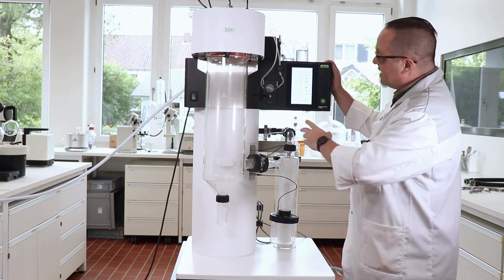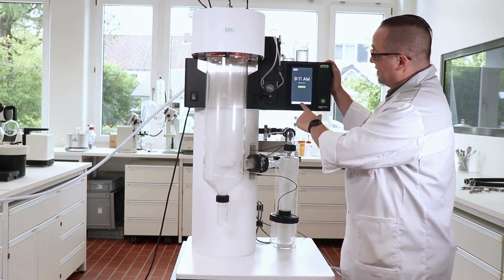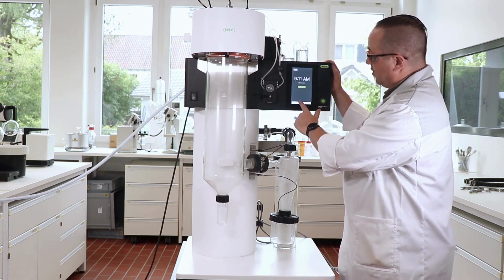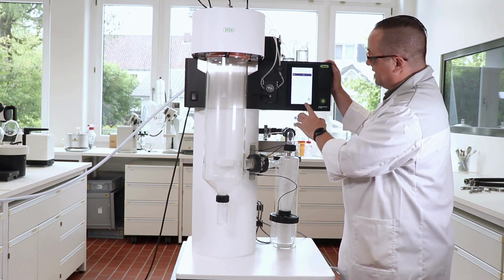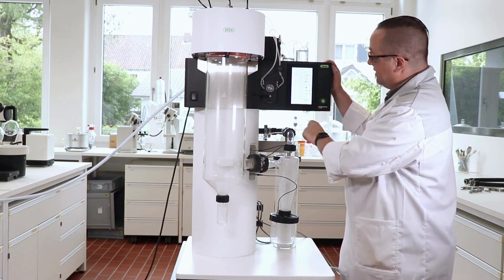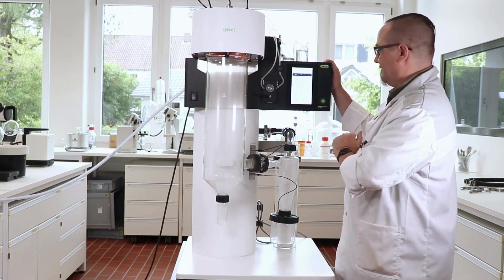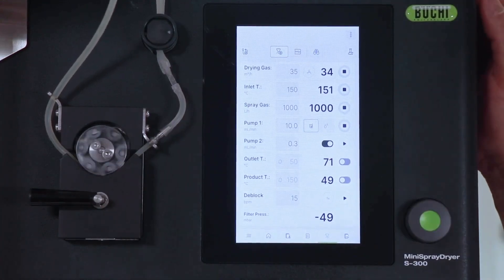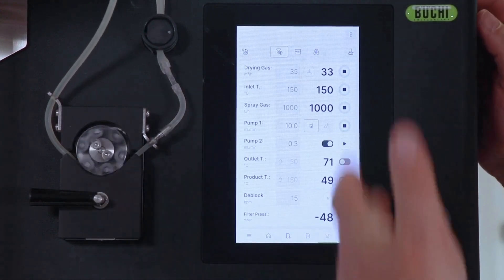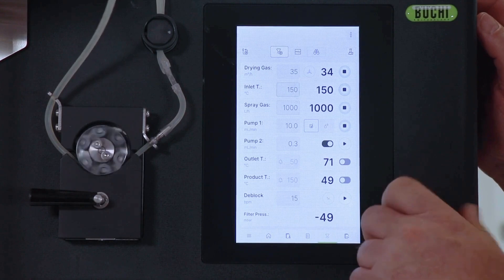Beside this main screen, we have also a home screen, a so-called method screen, a job list screen, a control panel, and a report screen at the end. While we are spraying our sample, I'd like to show you more of this color touch screen. We can use the knob to navigate — for example, selecting drying gas and pressing the knob once to enter another value, and you will hear immediately the effect.